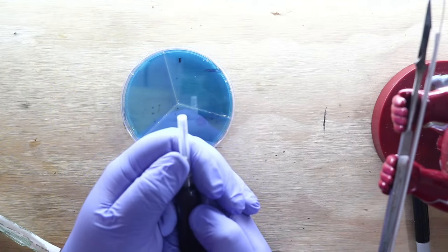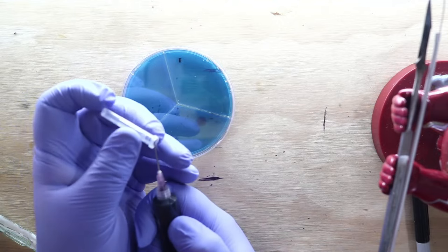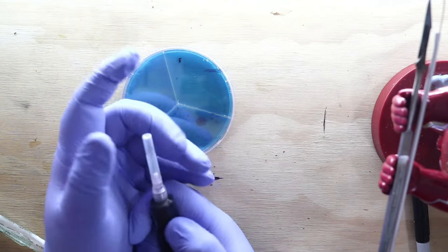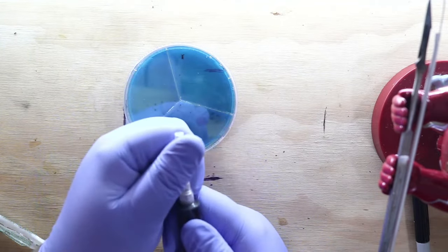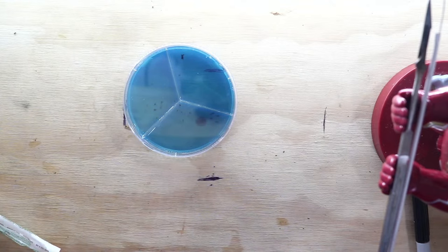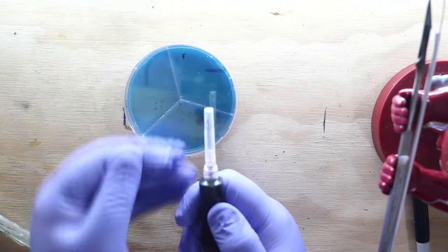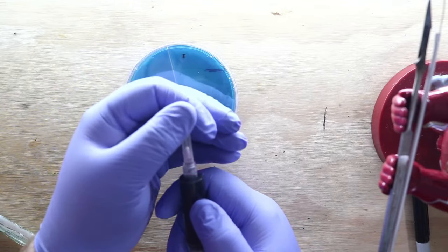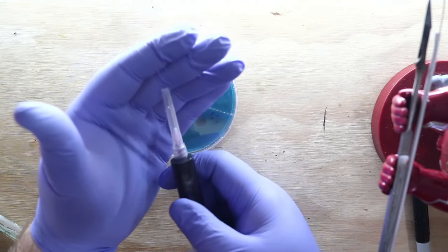When you take it off, you do the same thing: you unscoop it, right? Scoop it the other direction. I've seen first timers, when they take this off, they want to just grab it and pull. And what they end up doing is, it's got a click mechanism. Here, you can hear it. There, there, and there. When it clicks on and off, a lot of people have this reaction of, oh crap, and then they pull back. And when they do, they sometimes miss that cap, or they've got that cap off, and they stick themselves in the fingers. And that's a real bad day, so don't do that.